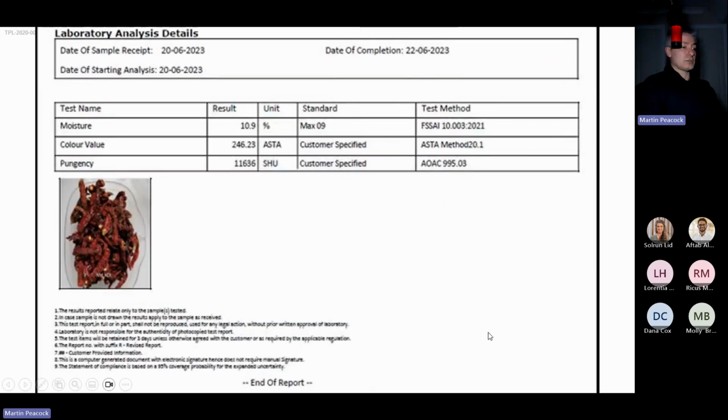So this is a classic. I only use this really for educational purposes only. But this is exactly what I'm sort of thinking. This is a certificate of analysis that's come from doing the HPLC determination of the pungency of these chilies. So here are the chilies. First of all, these are very heterogeneous.